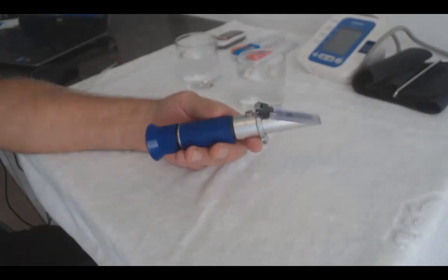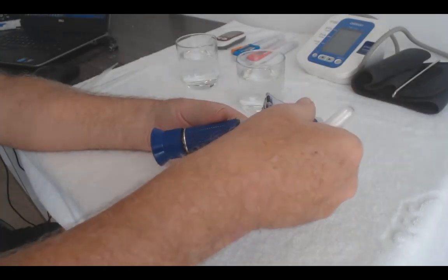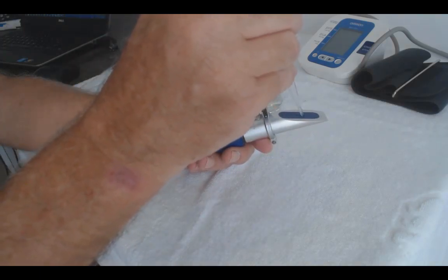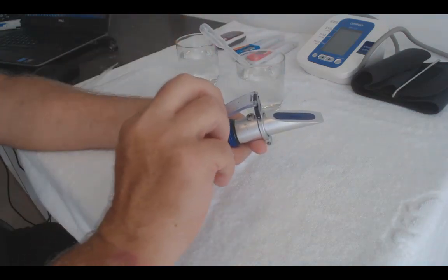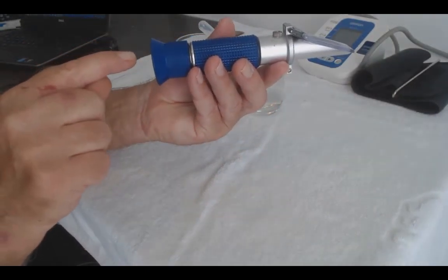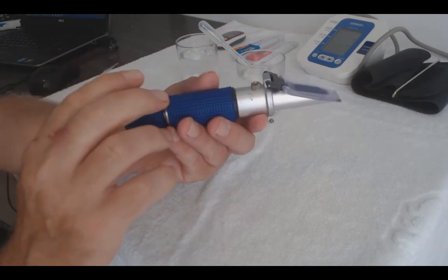Okay, so to calibrate, it's very, very simple, and we must use distilled water. It's a simple matter of opening up the flap here, taking a tiny drop of distilled water, placing the distilled water on the plate there, closing the little plastic lid, pushing it down. You can see it spread out, and then it's just a matter of looking into the sight glass, and what we're looking for is a 0 on the brix. As you look through, you'll see the brix on the left and you'll see the SG on the right. We're looking for a 0.